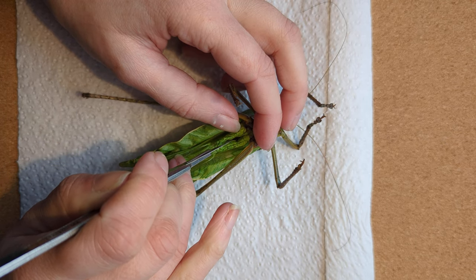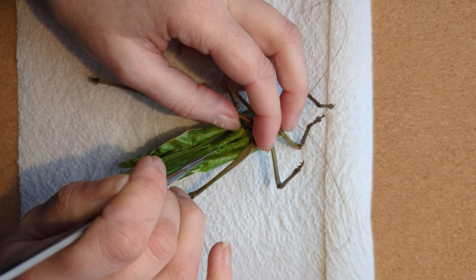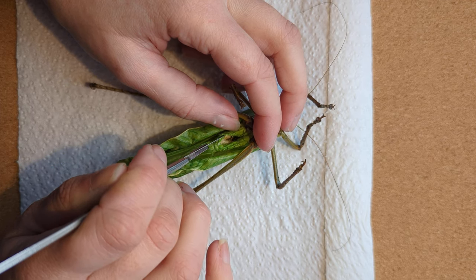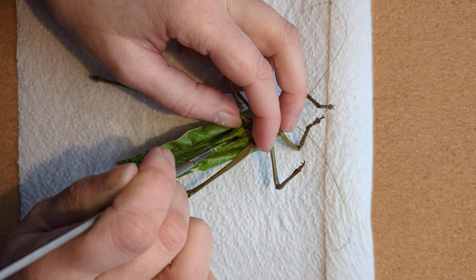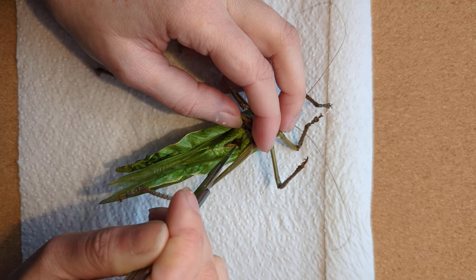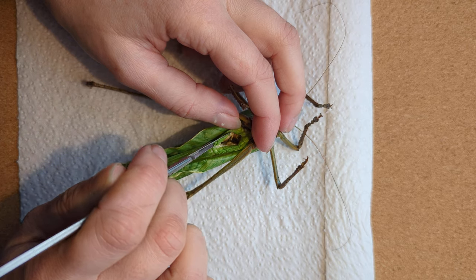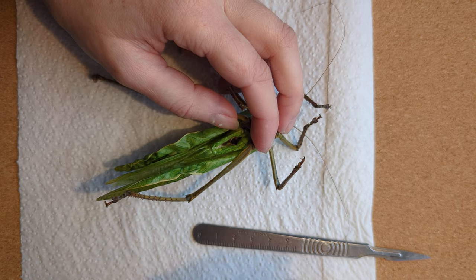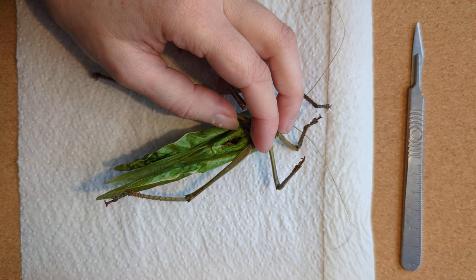With some insects it might be easier to actually reverse pin your insect onto your board just to help it stop moving before you start this part of the process. I'm not so worried because I'm quite confident handling them, but if it helps, pin them down with a few of the sewing pins.